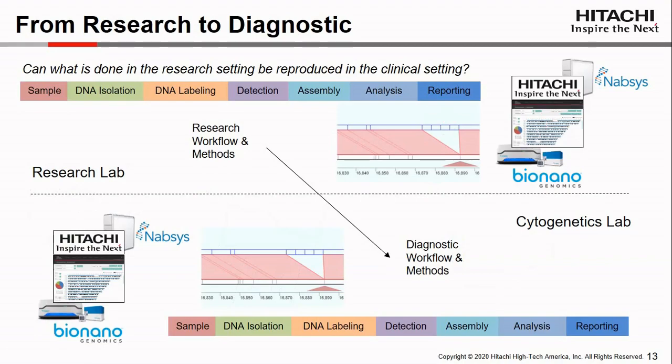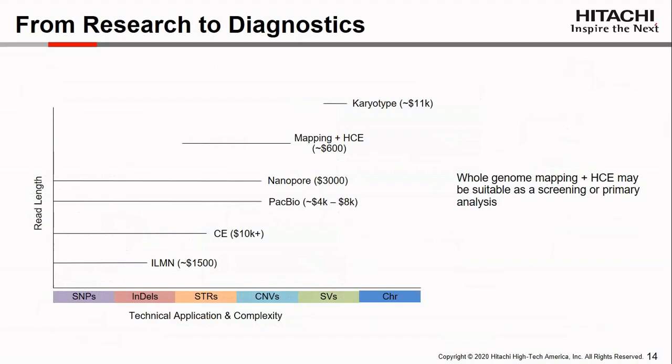This offers the potential of a single technology that can not only replicate the research and diagnostic utility of traditional cytogenetic platforms, but also provide the de novo analysis needed to close the gap in diagnostic yield. If we look at where genome mapping fits, it clearly fills the gap for a de novo molecular platform for structural variation detection and analysis.